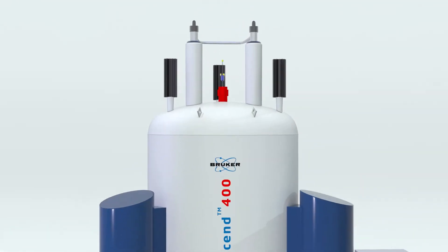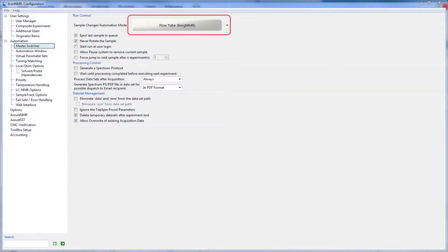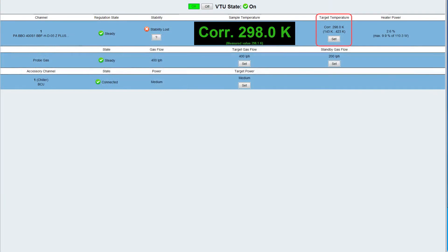Then remove the sample from the magnet, deactivate the sample changer if one is present, and set the sample changer automation mode to flow tube in the ICON NMR configuration screen. Set the desired spectrometer temperature and leave the gas flow at an appropriate value.